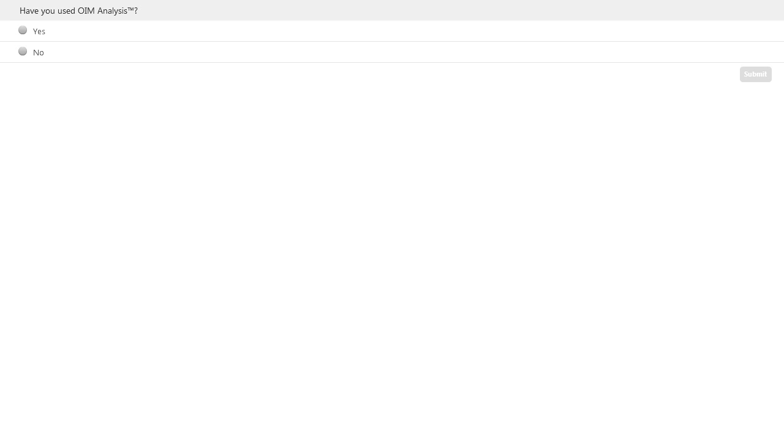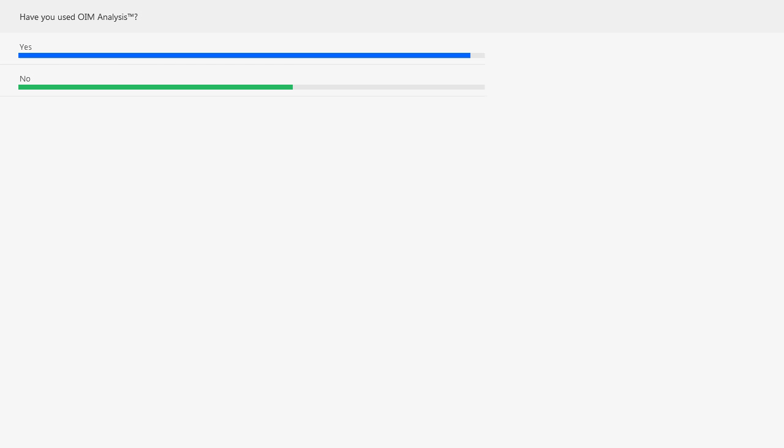So with that, we'll go to our first little quiz. We put a few quizzes in here, and what we want to know is, have you ever used OIM analysis before? I'll wait a few seconds. Go ahead and click yes or no and click the submit button. So it looks like we have about two-thirds who have used it and a third who are new to this. So I think that hopefully the introduction part will be very useful.